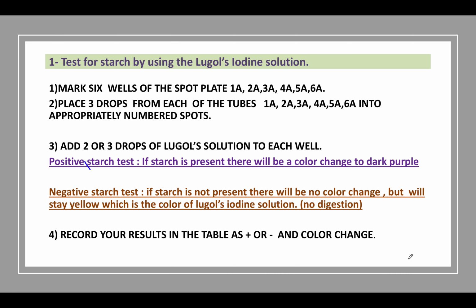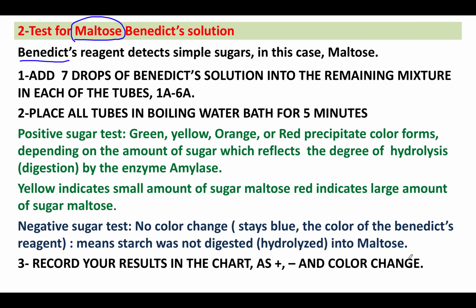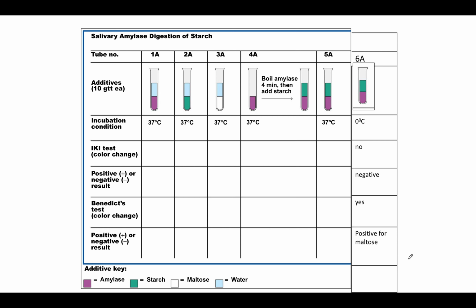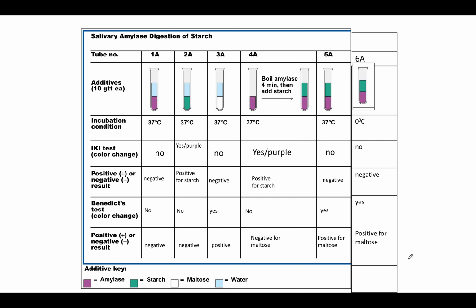Okay, so as you see here, I also added all the results in here. Theoretically, you should have done this at home and sent me all the information as an assignment, but I wanted to make it easy for you.